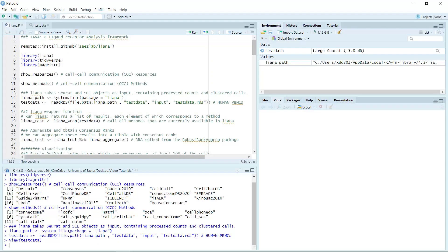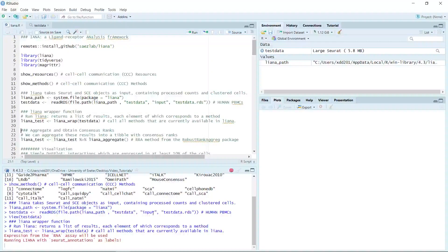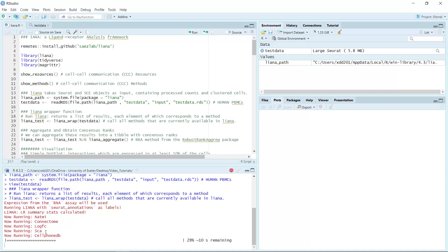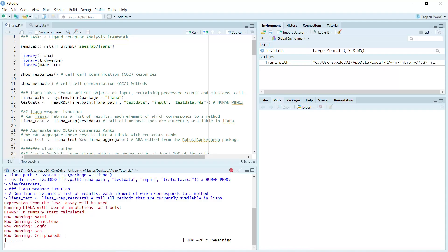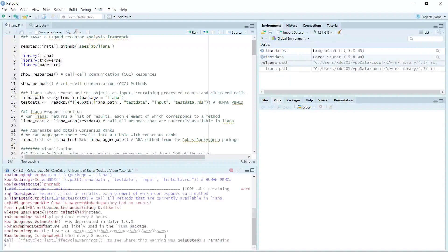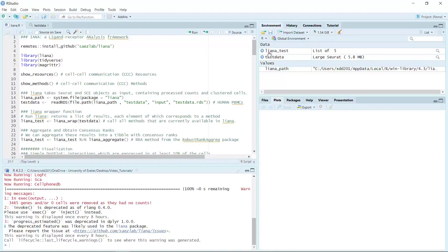Let's run the wrap function. You can see it is running for the NATMI, Connectome, logFC, SCA, and CellPhoneDB methods. You can see the package is running for each method to get the result. It is done. You can see now we have a result list.